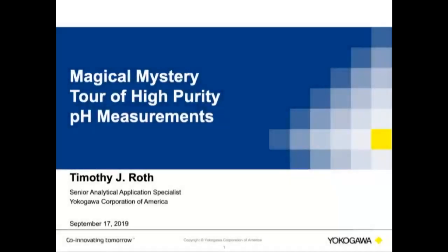Thank you so much for joining us today for our webinar Magical Mystery Tour of High Purity pH Measurements. Today we will be reviewing the theory behind the measurement of pH, discussing the issues surrounding high purity pH measurements, illustrating the difference between standard and solution temperature compensation, assessing installation requirements for successful measurements, and also clarifying good calibration and maintenance procedures.